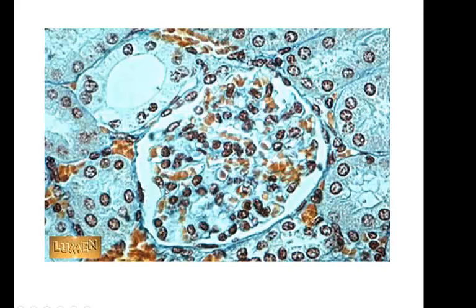Now really the filtration is occurring here in this capillary bed, and simple squamous cells are in this capillary bed itself, and filtration is occurring. But these are the simple squamous cells here, lining all around the edge. So there is a big nucleus there, and here is a big nucleus here. All of these cells out here are going to be a type of tissue that we're going to run into in a minute. There's a beautiful example here of cube-shaped cells. These cells right here are simple cuboidal cells.